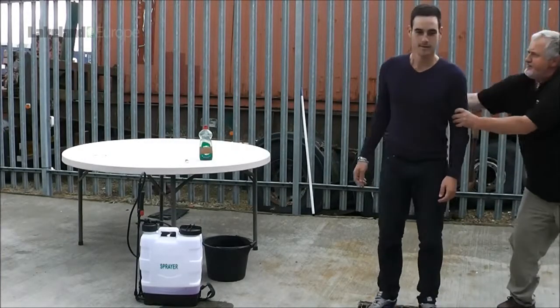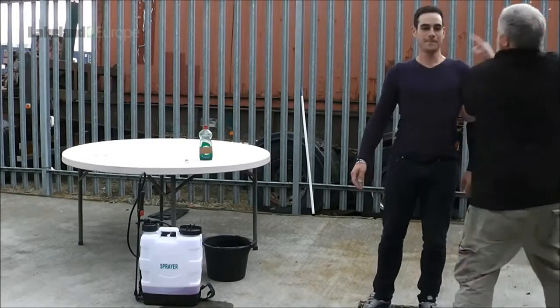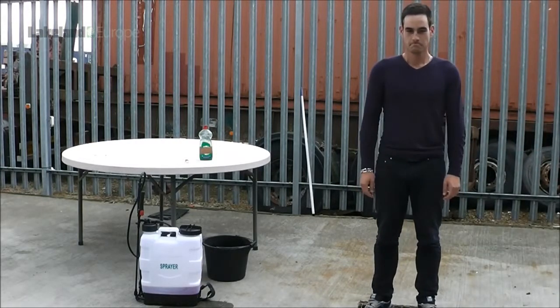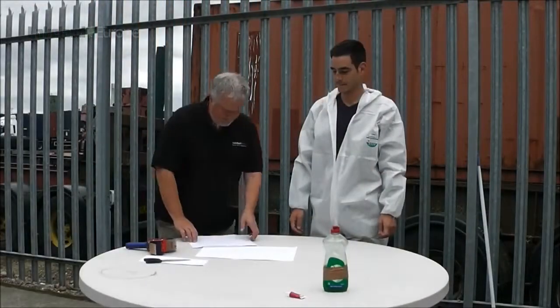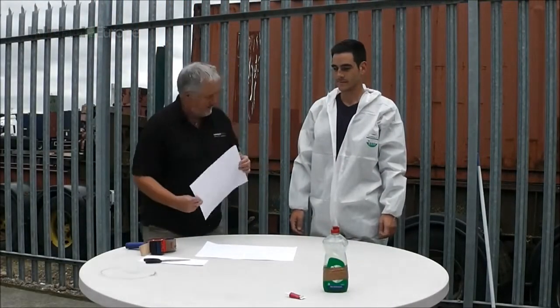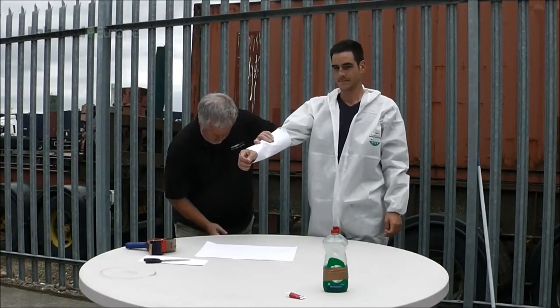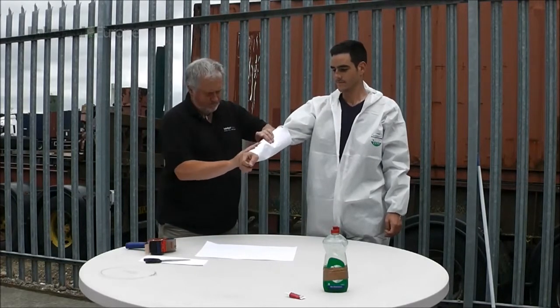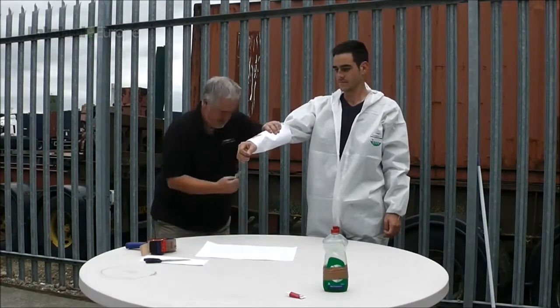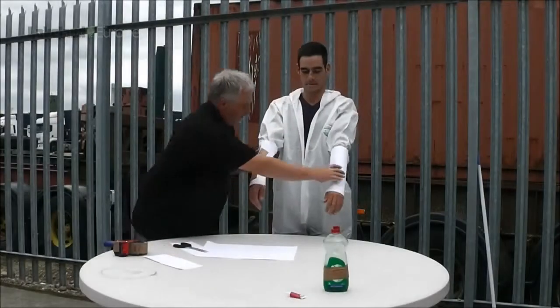Our lucky volunteer was selected. This is Romain, our French intern from Marseille, currently learning all about chemical protection and CE certification for chemical suits in our European office. To ensure any penetration of the liquid can be easily seen, we applied a long cuff made of blotting paper to each of Romain's wrists. This will absorb any liquid and ensure clear visibility of any staining. Romain was also wearing a Lakeland safeguard suit to protect those smart French designer clothes from any nasty red stains.